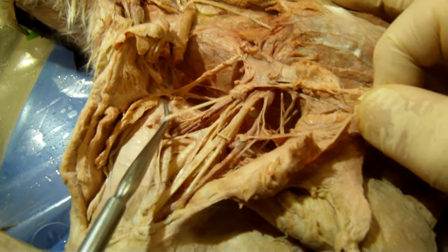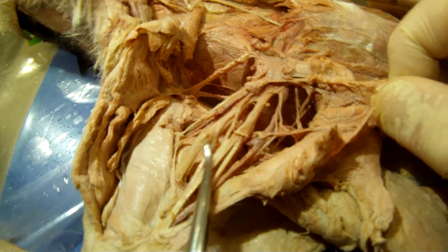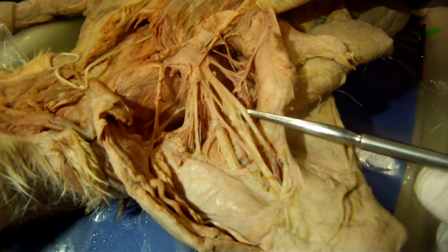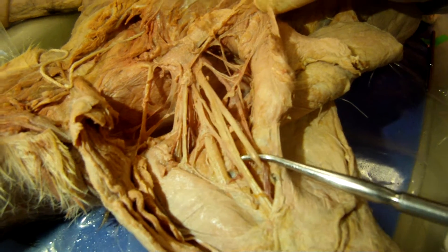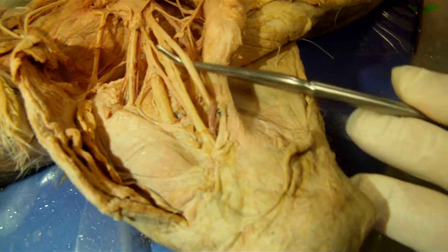Musculocutaneous goes right in the biceps brachii. Then we have a giant radial nerve, medial nerve, median nerve, and then ulnar goes right to the elbow. This is the ulnar.